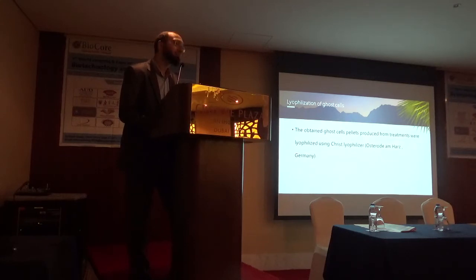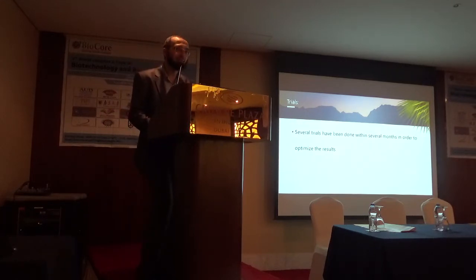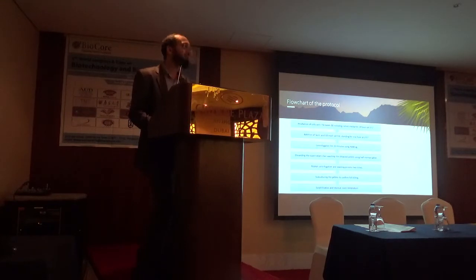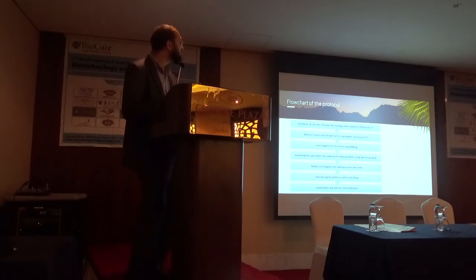In order to preserve bacterial ghosts for a long time, we lyophilized them. Lyophilization, you know, uses freezing and drying at the same time. And we did statistical analysis using ANOVA. Several trials were done within several months in order to optimize the results. This is a flow chart of the whole protocol. I can summarize this protocol.